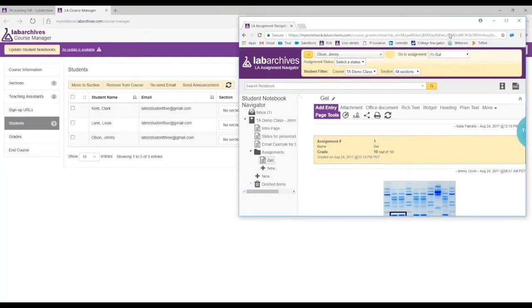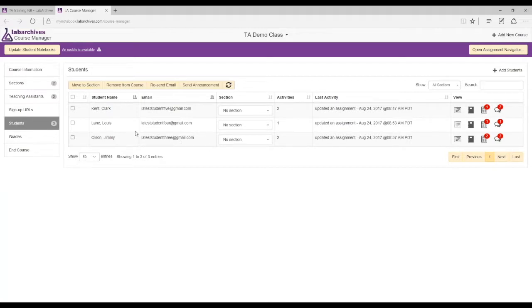In your course manager, you also have access to a Grades tab, which is under Students. In there you should see the grade report that was just generated. If it appears blank and says 'no matching grades found for the TA demo,' don't worry — that's actually a useful thing to troubleshoot.